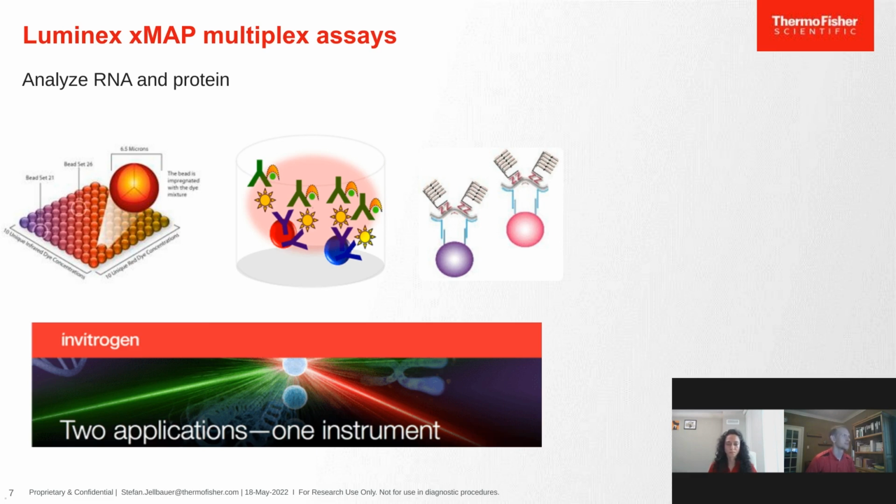multi-analyte profiling. In brief, Luminex invented small magnetic particles or beads that are dyed or coated with a different mixture of dyes, which provide a unique fluorescence emission to different beads, and therefore enabling the concept of multiplexing. We at Thermo Fisher are assay developers and take advantage of this principle to build multiplex assays that can analyze up to 80 targets for RNA and 80 targets for proteins. And we use specific oligos or antibodies to capture these targets from various sample matrices.